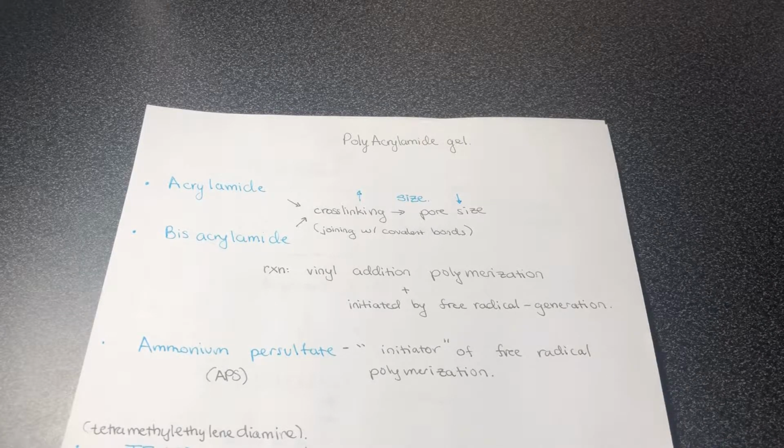So if you have a fast moving protein, small molecular weight, you want it to be thick. If you don't have something that's fast, you're going to have it thin if you want it to flow a little quicker. Now that's relative, but the ratio is something to consider.